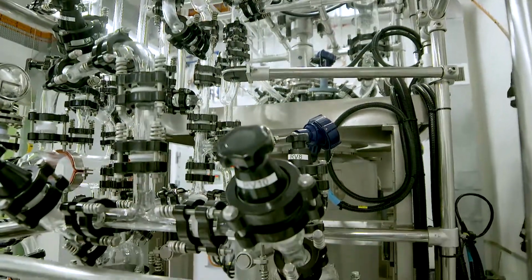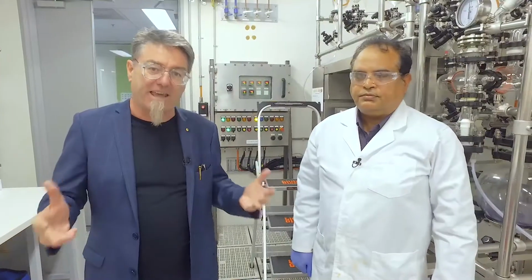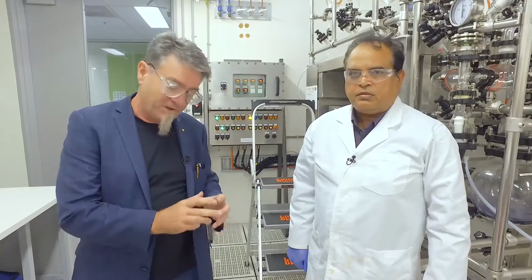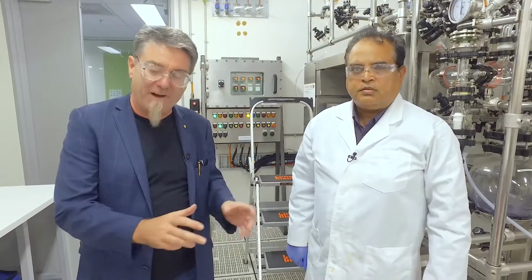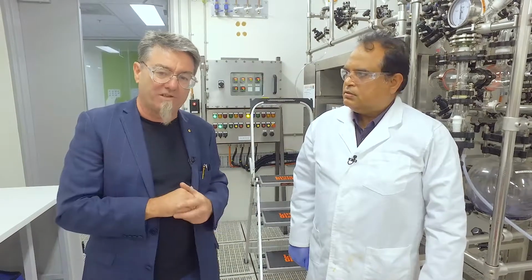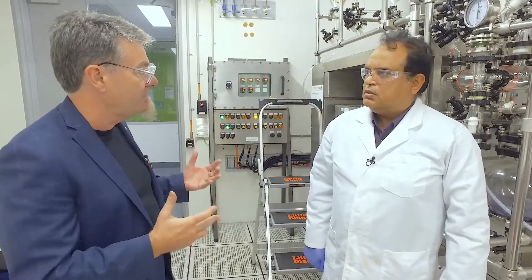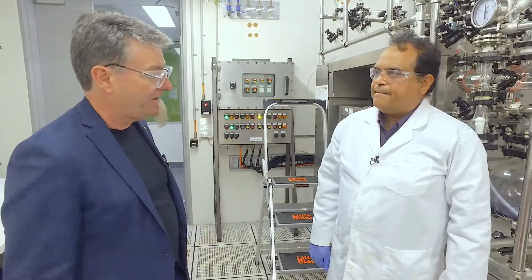It's really important that all of those chemistries that we've just been talking about are actually scalable. It's one thing to be able to do chemistry on a bench at a milligram scale or a gram scale, but to take those same chemistries and process graphene into tens of grams or hundreds of grams and still retain those special properties has other challenges. So Sanjeev, can you tell us a little bit about the challenges we encounter in scaling those processes for graphene?